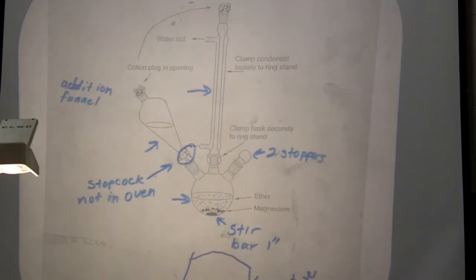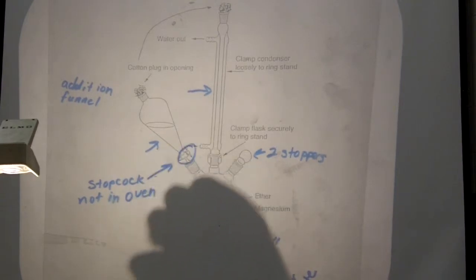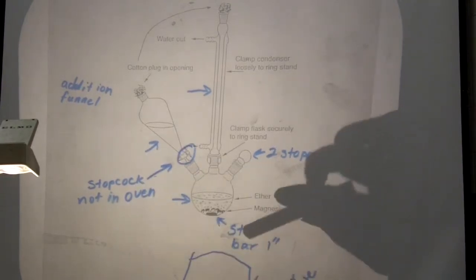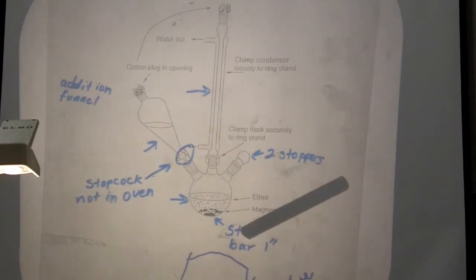Once it is cooled enough that you can handle the glassware, this is what you want to assemble, okay? You're going to have your stir plate on your ring stand. You're going to assemble your 3-neck flask above your stir plate. And you want to leave probably a good 3-4 inches between your stir plate and that round bottom flask, okay?